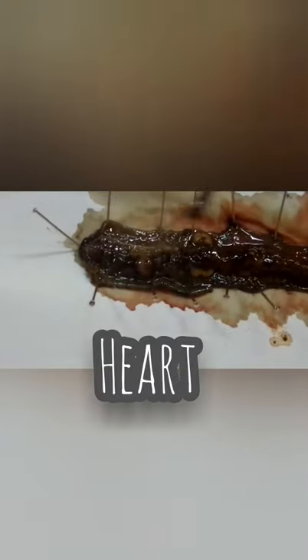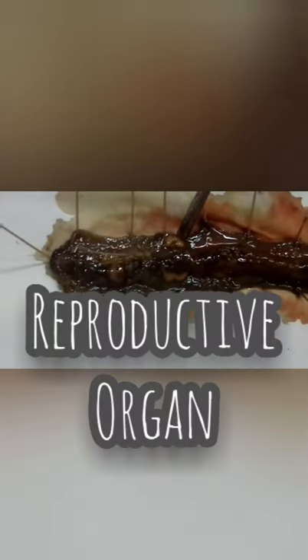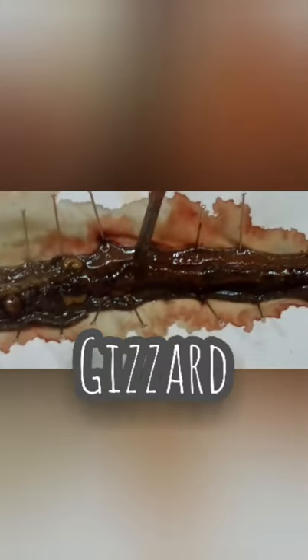Here is the heart, and this whitish internal part is the reproductive organ, and this part here is under the clitellum. If the part here is soft, as you can feel, it's called the crop, while the firm one here is the gizzard. Then all along here is its long intestine, and the part here is the anus.